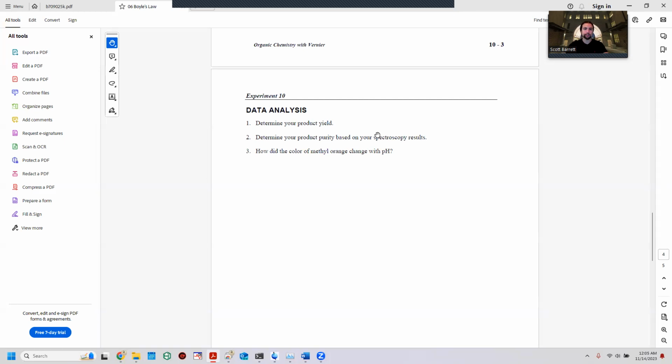So that's the difference between the two, and that's the key indicator here, teaching you all how to utilize UV vis spectroscopy to find purity, but in two different ways. Whereas in the methyl orange situation, we're finding it of only methyl orange. In the aspirin situation, we are figuring out how much salicylic acid or starting material is left over in order to figure out the final purity of it.